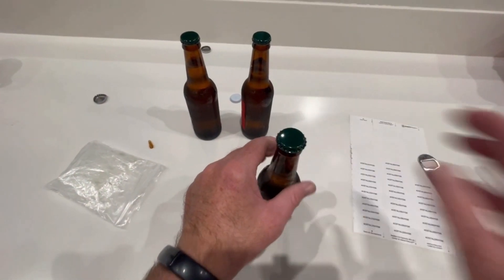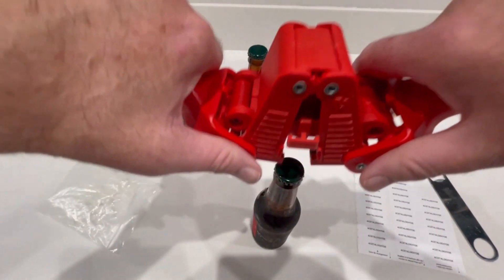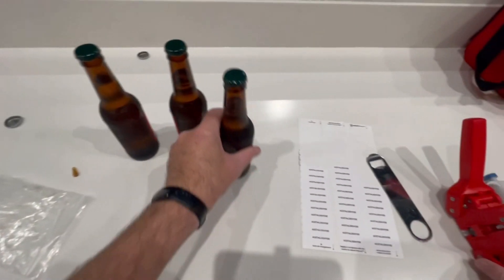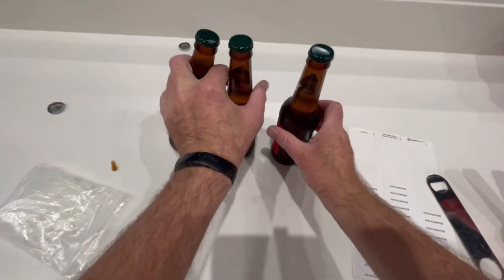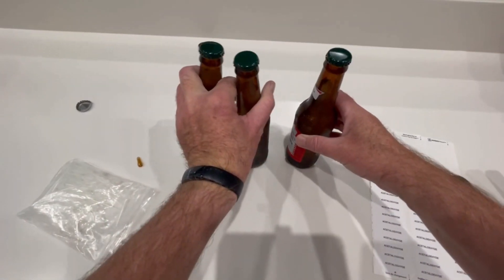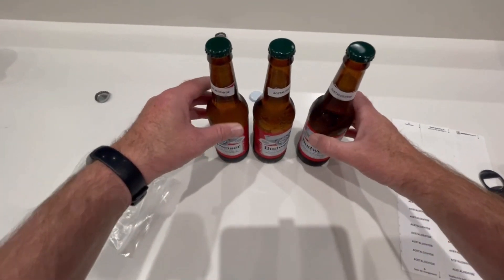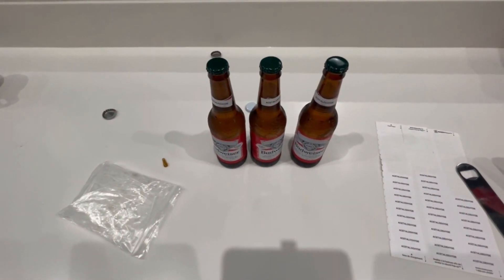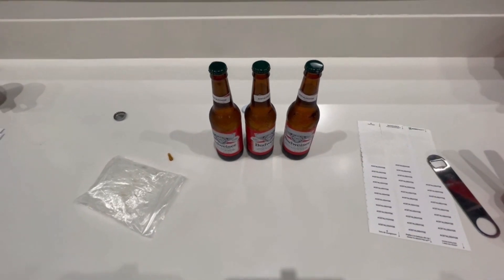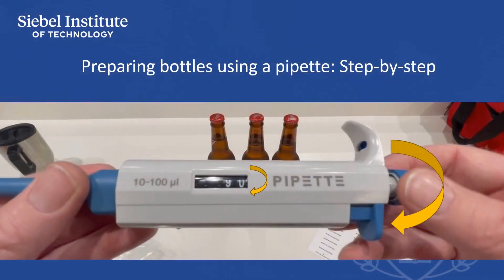To assure the bottles are properly crowned, tip each bottle slowly, then stand them upright, looking for escaping foam or drips. If a bottle leaks, remove the crown, re-crown the bottle, and test it again for leaks. Keep the bottles refrigerated until you are near the time of your tasting session, then remove them from refrigeration, timing their service to have them at an appropriate temperature for the nature of the taste panel.